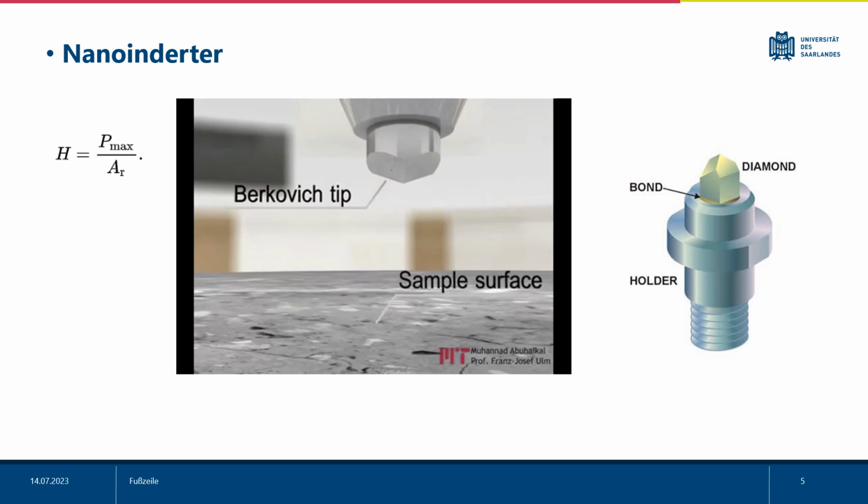It has a wide variety of tips such as Berkovich, cube corner, Vickers, and knoop. Here we can see the Berkovich tip.